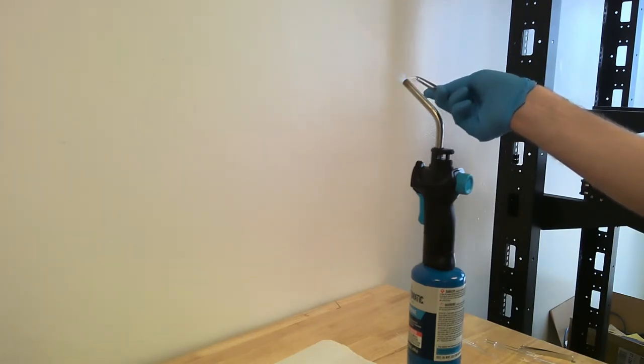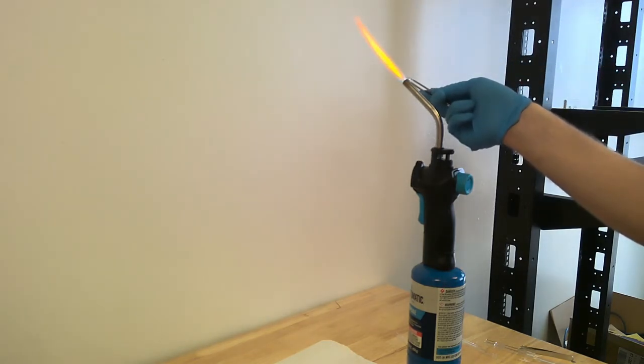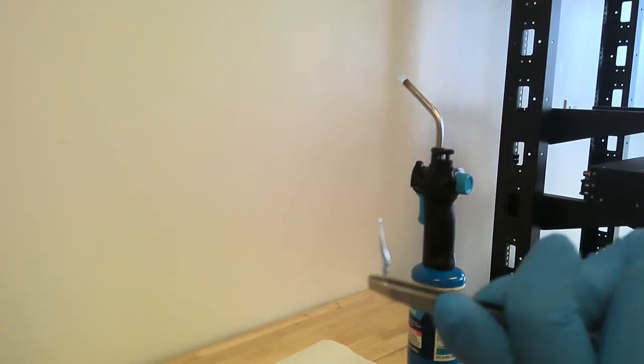We always want to make sure the ends of our glassware that we've broken are flame polished, so that we've minimized the risks of cuts. Okay, so now we've flame polished the tip of our micropicnometer, but it is still open, and we're able to dispense liquids into our micropicnometer.